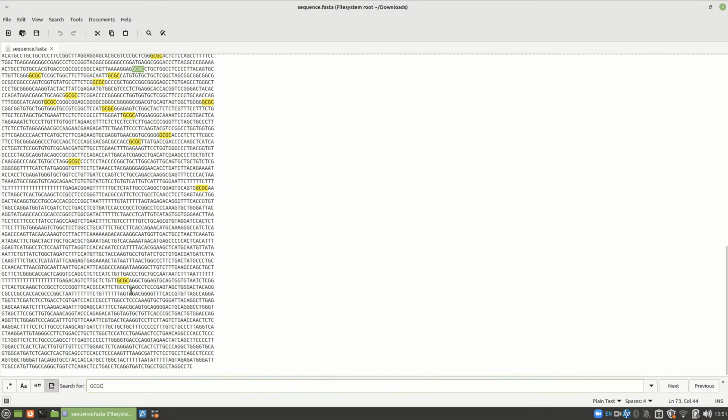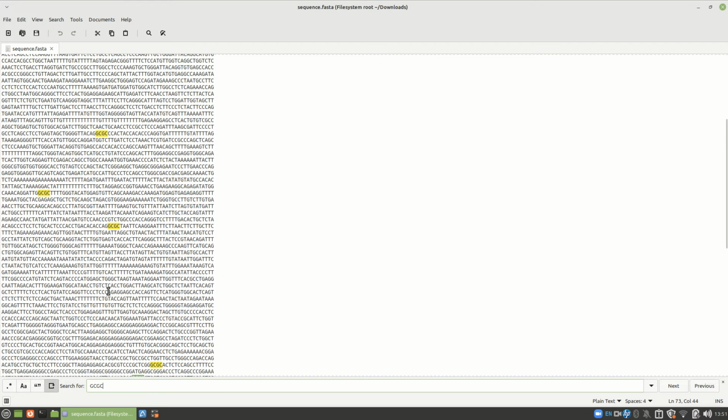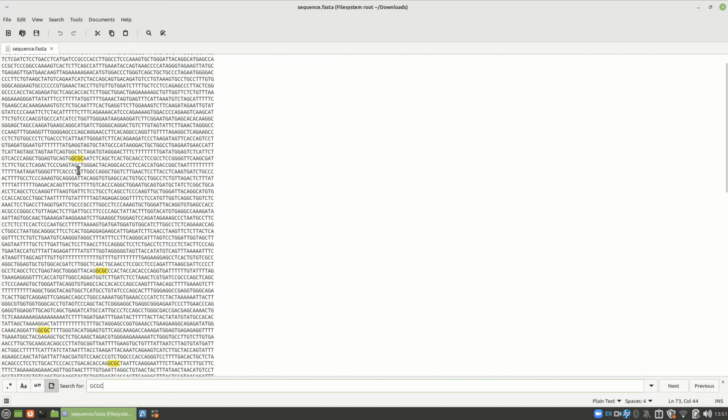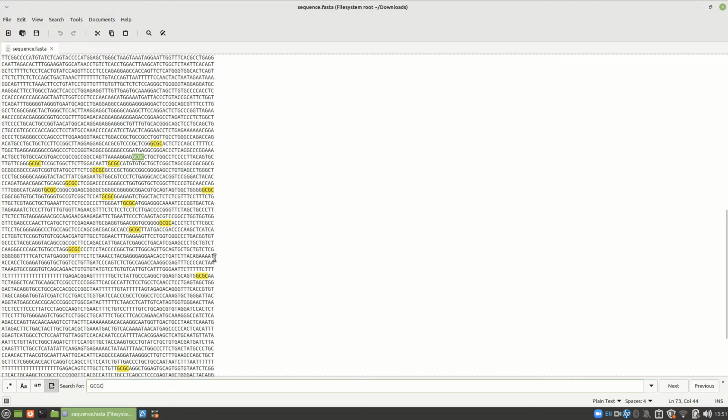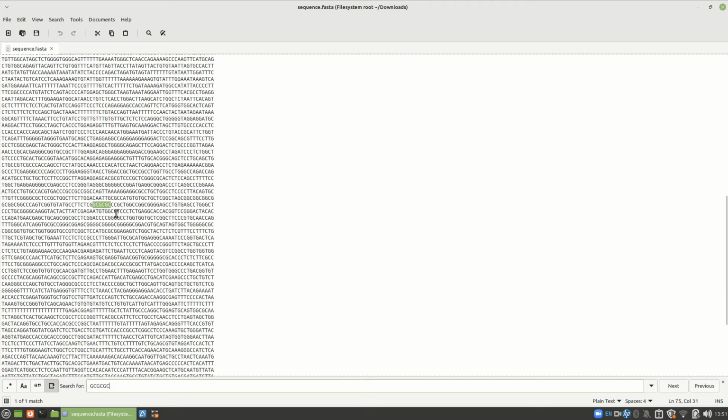All right, you can see there's one lone one down here. There are three up here, maybe a kind of a straggler up here, but definitely a lot here. This is your CpG island. So I'm going to add a third one, and we'll see if that's useful at all. And yes, it only shows up in one place, right here in the middle of our CpG island. As you can see, there are two if I take off one, and then the others appear. This is definitely our CpG island.